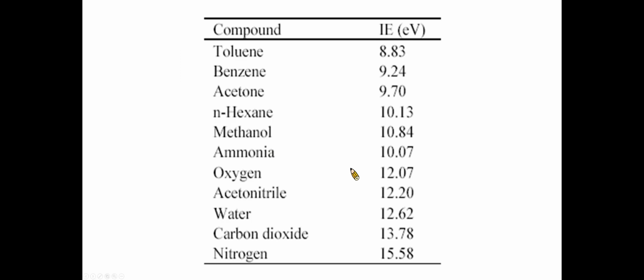The ionization energies of the commonly used solvents are summarized in this table. The consideration of an appropriate solvent is critical in APPI experiments. Usually the solvents need to be compatible with the UV lamp. In other words, we would prefer the formation of solvent ions to embark the chain of chemical ionization.